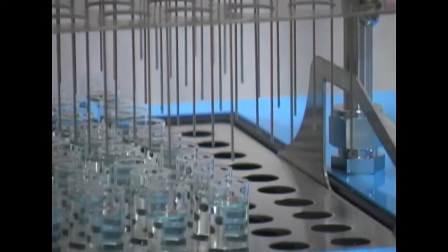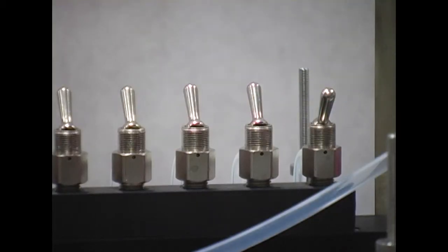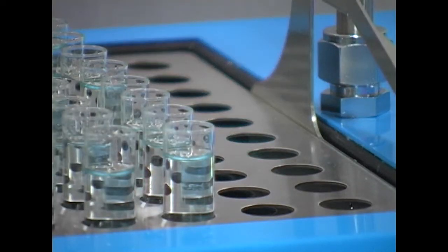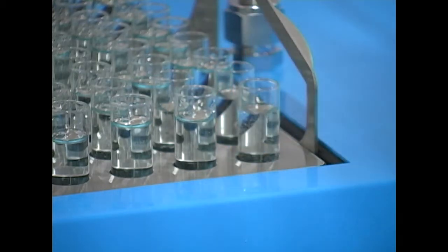When not in use, the user can conserve gas by using the on-off valves for every row of eight samples. Unlike other evaporation systems that offer generic sample rack sizes, each Multivap is expertly designed to fit your test tubes.